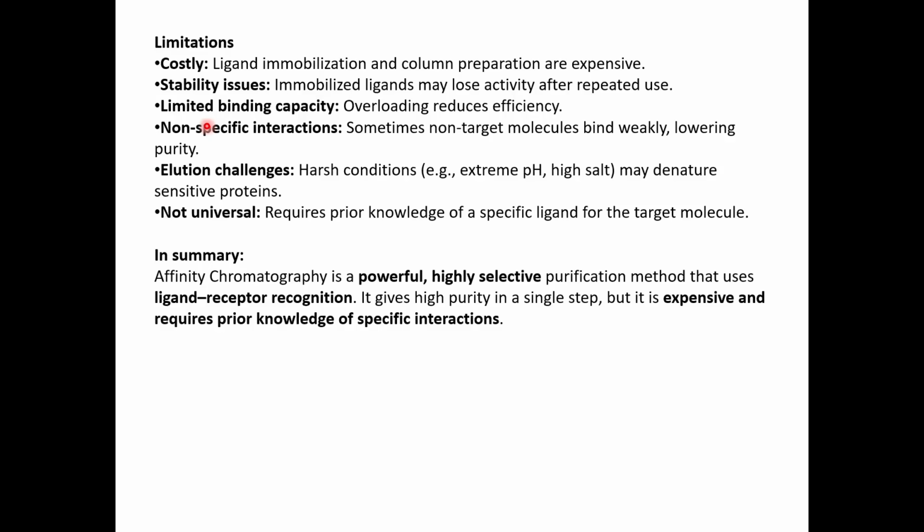So sometimes, depending upon the lysate you have, or depending upon the source of your sample mixture, you might have some unknown interactions happening. If you don't know all the components in your sample, then sometimes you might not know the non-targeted interactions. In such cases, the specificity decreases, so you won't get the complete pure form of your target. So sometimes non-target molecules bind weakly, lowering the purity.